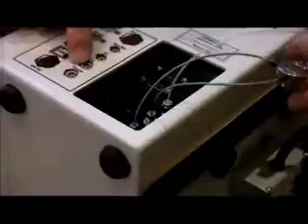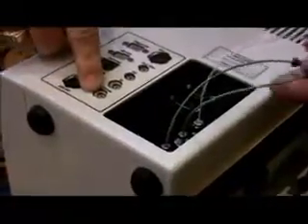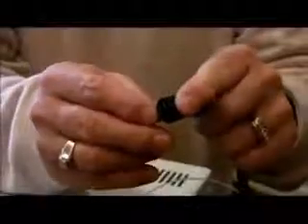So now what you see is the hydrogen feeding the fuel for the FID, and the carrier gas supply, and the Teflon tubing that's white here is supplying the air. And on the back is a 24-volt DC power supply. It goes through this cable. There's a little locking ring on the cable itself, so once it's seated and in place, you twist the locking ring and it holds the cable in place on the side of the utility panel. And you can see there's a little key right here. It's kind of hard to see because it's black. And basically what happens here is you can't get it wrong. You push it down and into place, and you twist the locking ring until it clicks, and then it's in place.